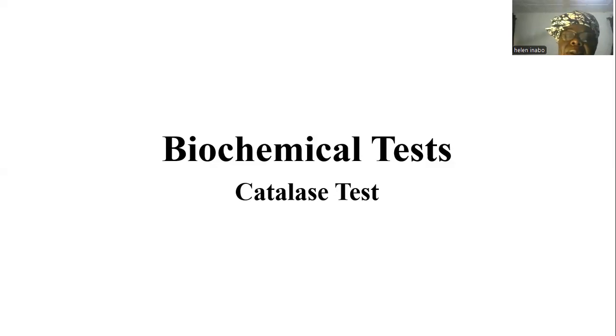Good day, everyone. I'll be discussing an important biochemical test, which is usually one of the first tests performed in identifying an unknown organism, the Catalase test.